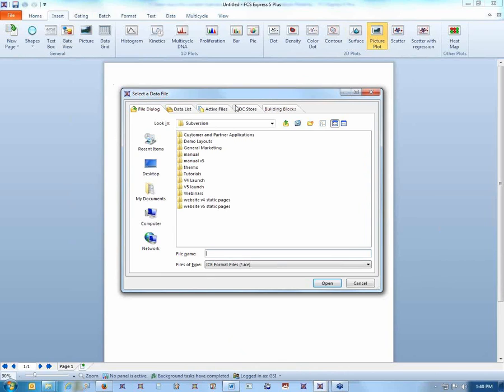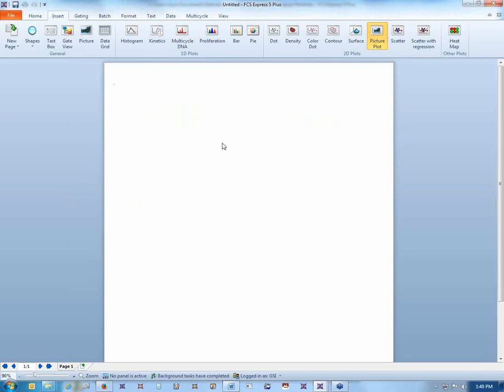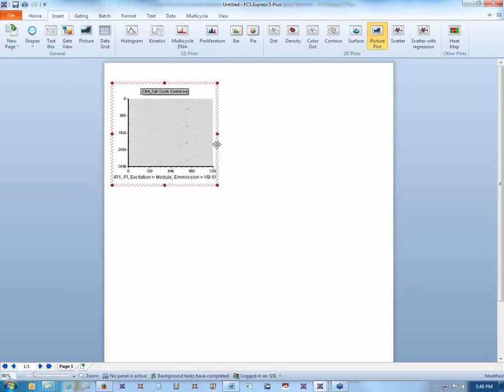They make these nice benchtop image cytometry experiments, which make it easy for, you know, a typical lab to just access the benefits of image cytometry within their own lab. So not a lot of bench space is needed. It's very easy to use. And we have some data files from a cell cycle experiment from a Nexcelom instrument. So let's go ahead and put one of those in. And the really cool thing is these days Nexcelom is exporting to ICE, so we can read that ICE format, which is the Global Image Cytometry Experiment standard format.